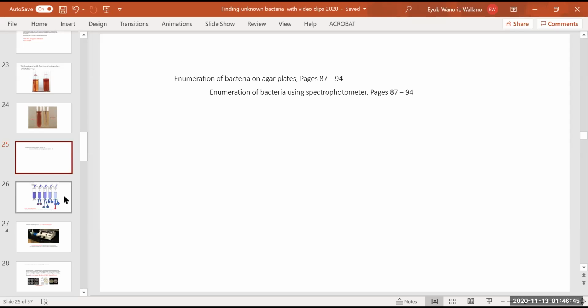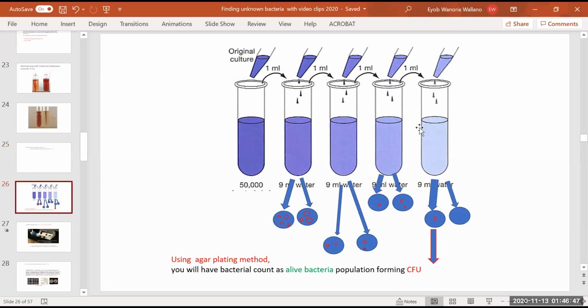Look now here. Are we going to do this one? Well, we are not going to do dilution, but look now, there are bacteria here. I made them colonies. Colonies are reddish, pinkish, here on this surface. Now, they are live bacteria. Why focus on live bacteria? Live bacteria grow, they don't die. So when we say colony, you need to know the bacteria is colony forming, which means the bacteria is alive. Okay, that you need to know.